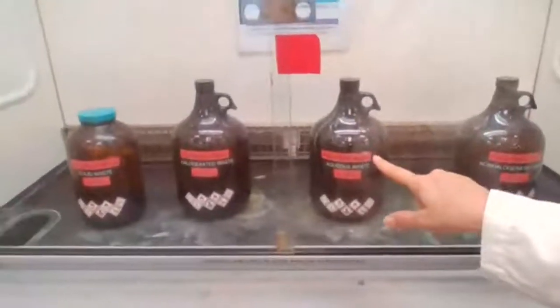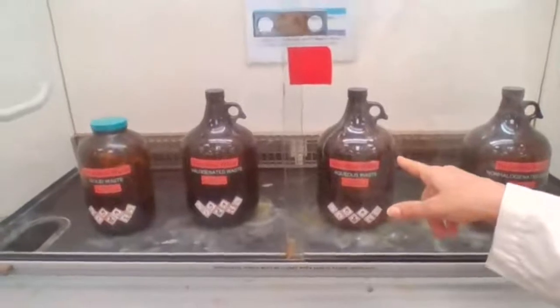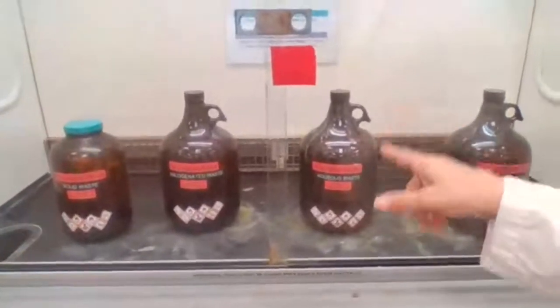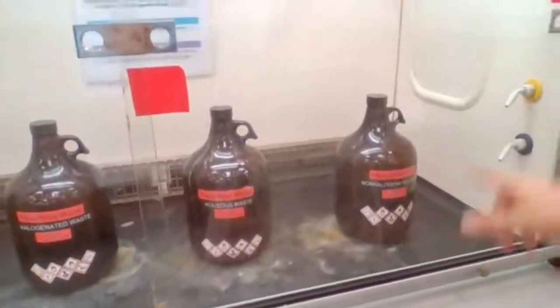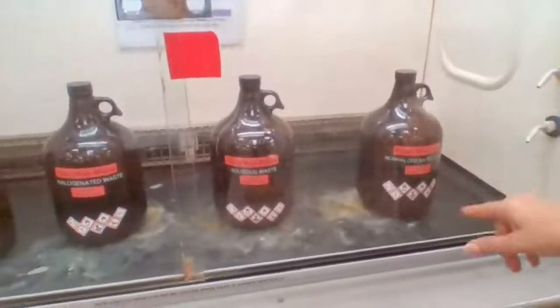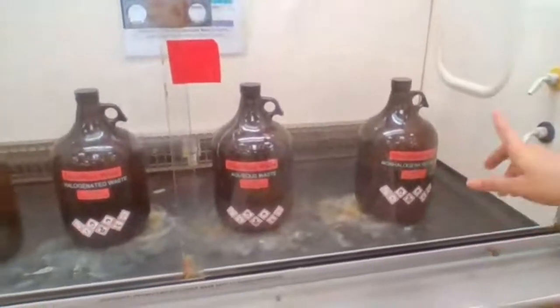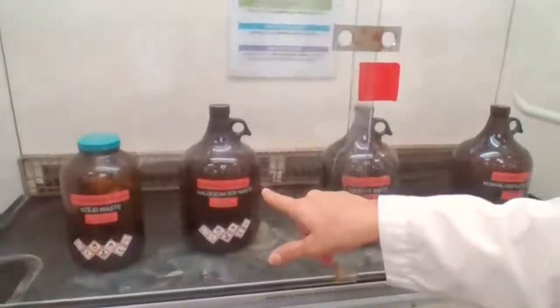Aqueous waste is anything that is water soluble, not organic compounds, like acids and bases, and would be disposed into aqueous waste. And then we have non-halogenated waste. These are organic molecules that do not have halogens, chlorine, bromine, or one of the halides. The halogenated ones do contain halogens.